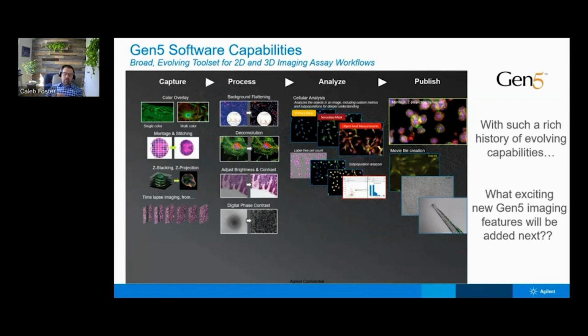And then there are a lot of limitations, specifically in image analysis, around PC-based algorithms that have been identified over years on fluorescent-based images. That's where I'm excited about the potential of artificial intelligence and machine learning. We're already seeing it used some in our field, but the capabilities and potential are really just starting to be uncovered. So I'm tremendously excited to see how those two technologies will shape the future of our field.